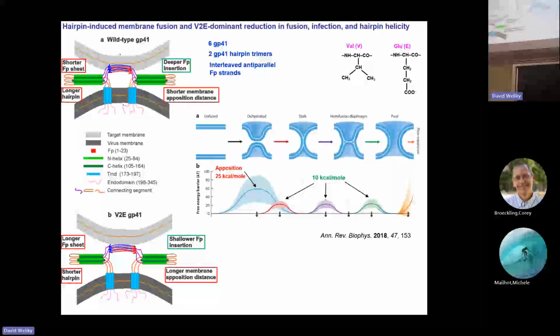I think Matt's referring to something where individuals in the group, it isn't so clear, but now I can explain it. The fusion peptide line widths were always much broader than would be typical for a protein with a single structure. Now I can say the reason the lines are broad is because you typically get sharp lines with a single structure. We have 10 different structures, with slightly different chemical shifts. That's why the lines are broad.